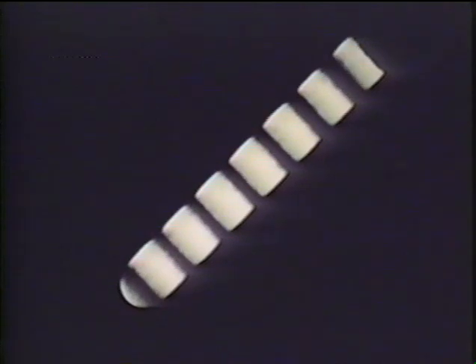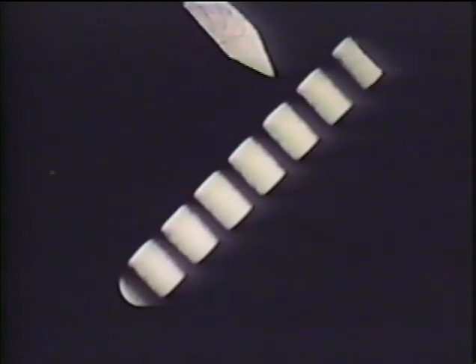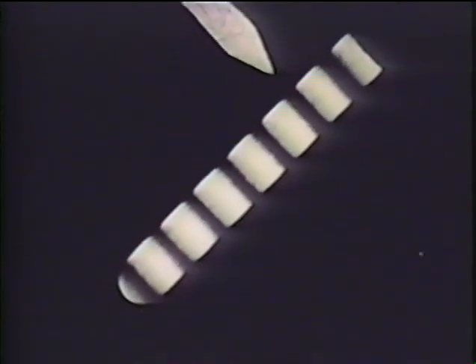The values for the retardation along this scale can be found by reading the wedge itself in monochromatic light. As the thickness of quartz increases, the brightness at first increases. But just as in the stepped wedge, each full wavelength of retardation is marked by a black band.